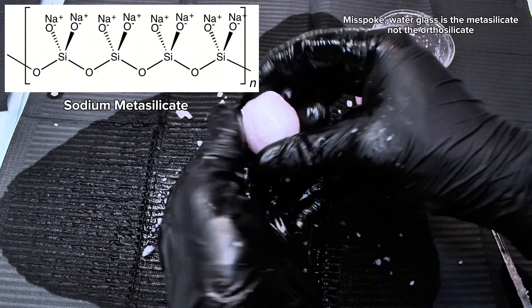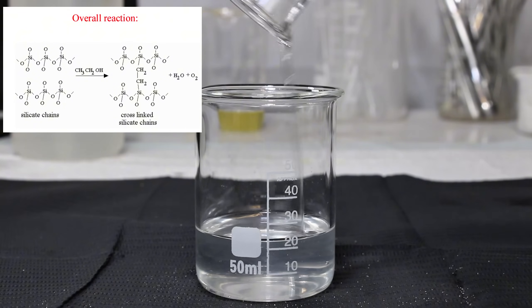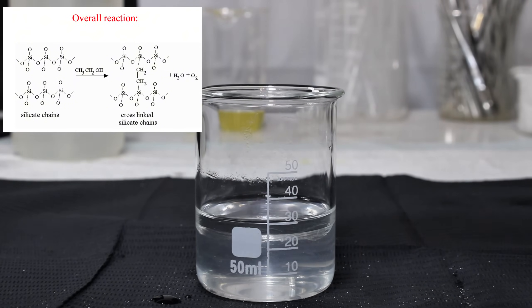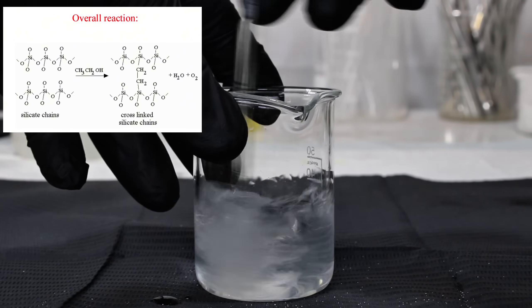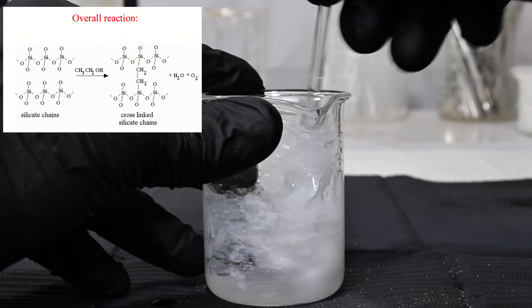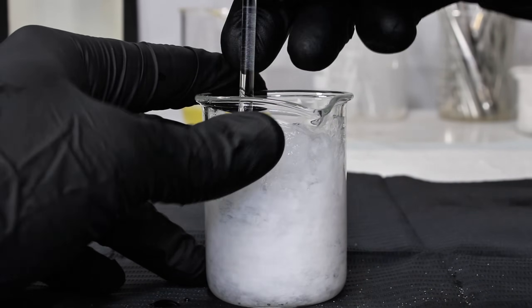When ethanol is added, the silicate particles begin to link up with each other to form long chains as the ethyl groups replace oxygen atoms in the silicate, along with the displacement of water. Because the specific oxygens that get replaced are random, some ethyl groups become cross-linked between chains, further increasing the size of the resulting molecule. The resulting large molecule is a solid and simple silicon polymer.